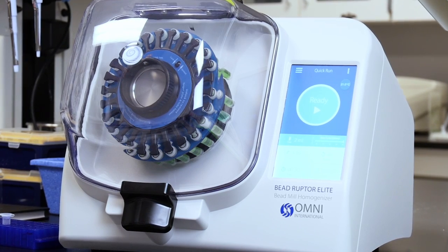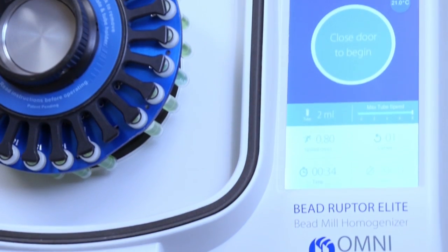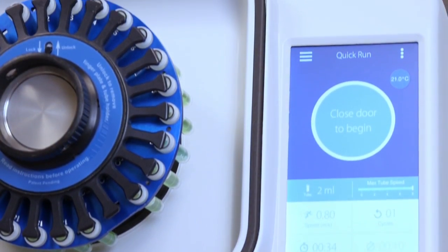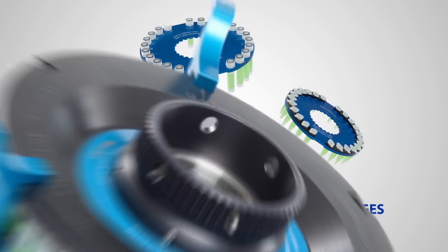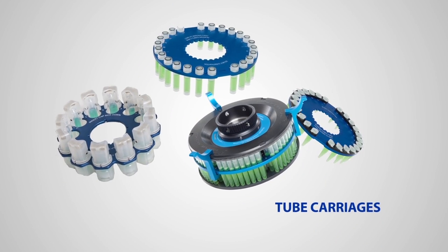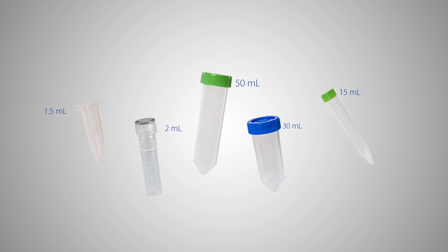With unrivaled versatility, the Omni Bead Ruptor Elite is compatible with the widest range of accessories including an array of interchangeable tube carriages, allowing for sample volumes from as little as 250 microliters to 50 milliliters.